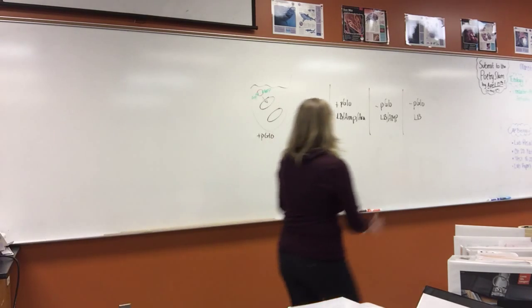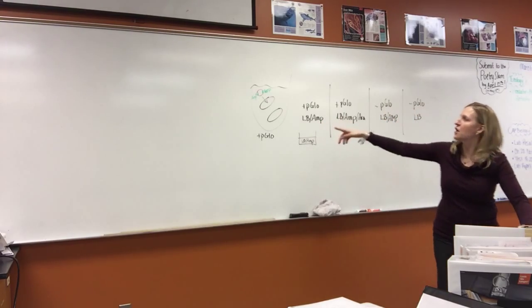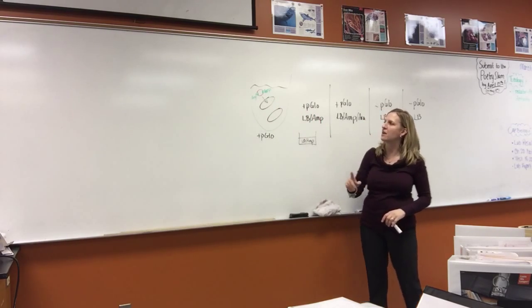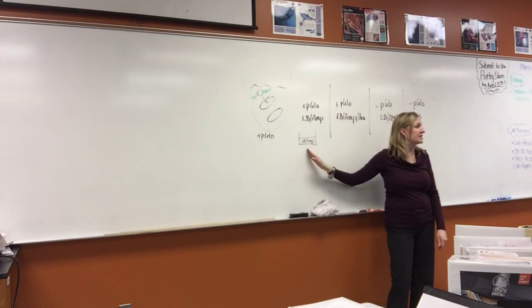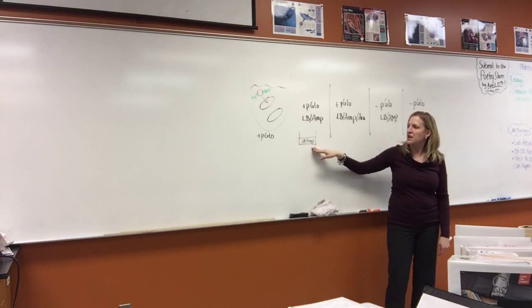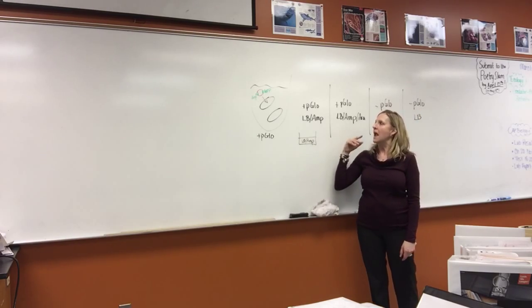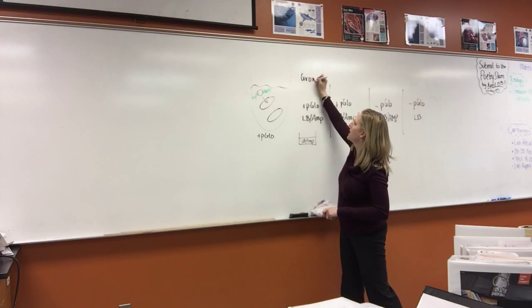Okay, so these were our four, and so this is what happens when we put the plasmid in. So you have some transformed bacteria and some that are not. You sucked up 100 microliters and you put it on the LB/amp petri dish, and then you spread it around with the loop. You put it in the incubator where it's nice and warm, and you should have had growth. So everybody should have seen growth on this plate.